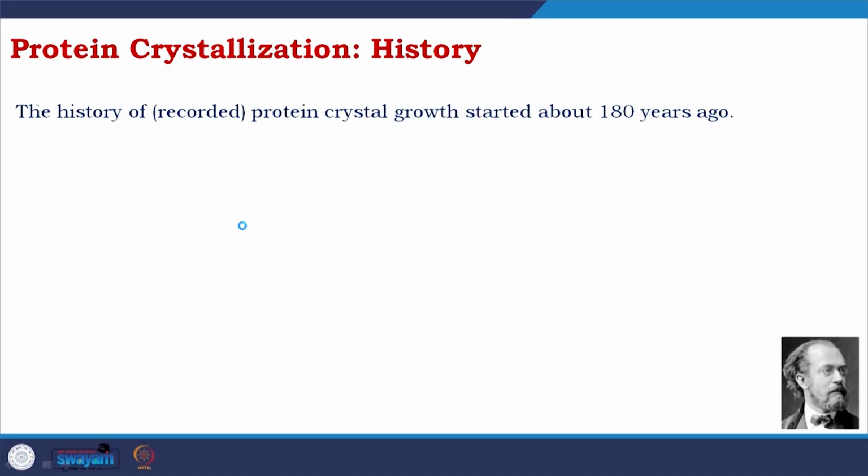Anything we are going into, we should know about the history. The history of protein crystal growth started about 180 years ago. Think about it, 180 years is what is recorded. There were other attempts which were not at all successful, so they were not recorded.